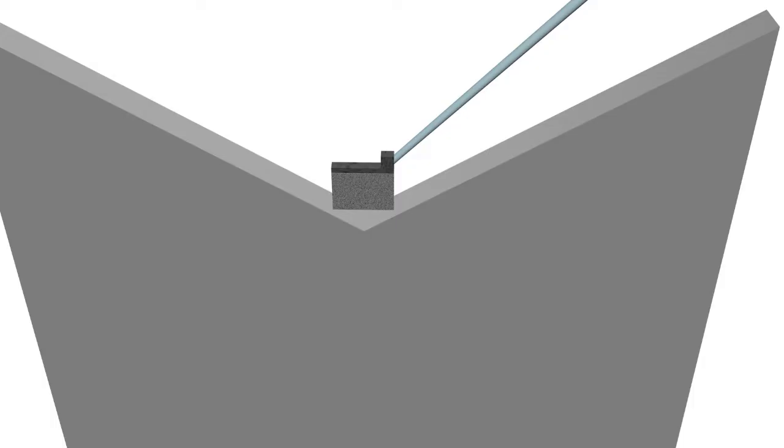In order to do transmission electron microscopy studies, the lamella needs to be attached to a special V-shaped holder. Using the omniprobe, the lamella is moved to the holder.